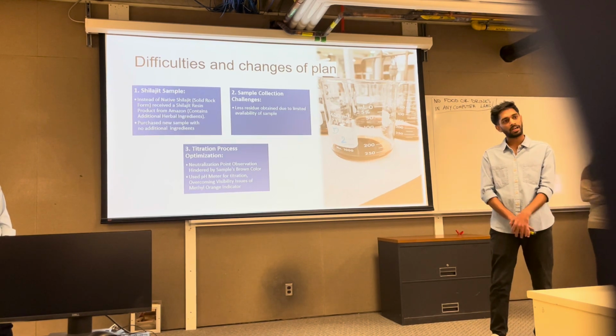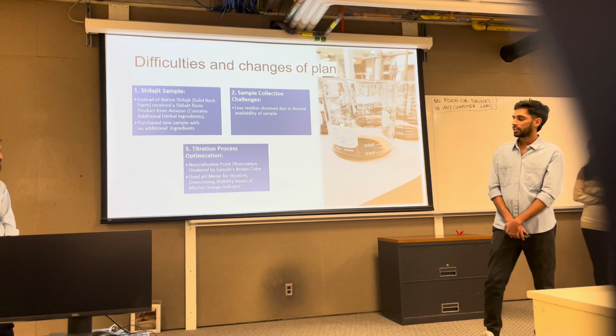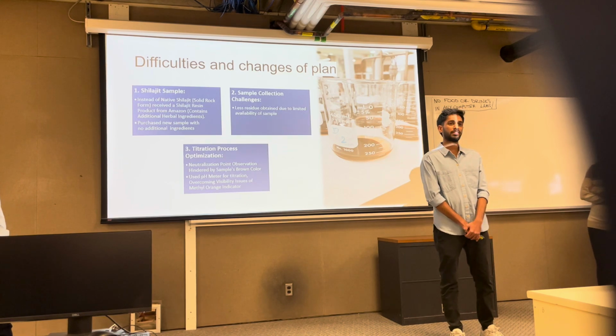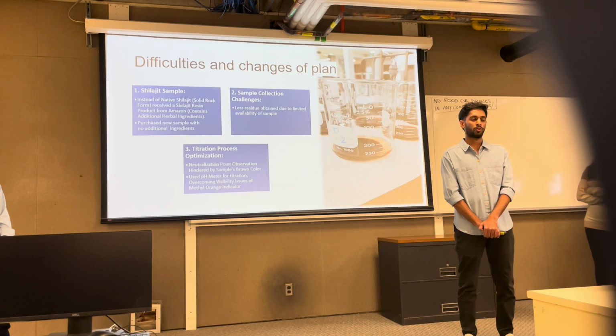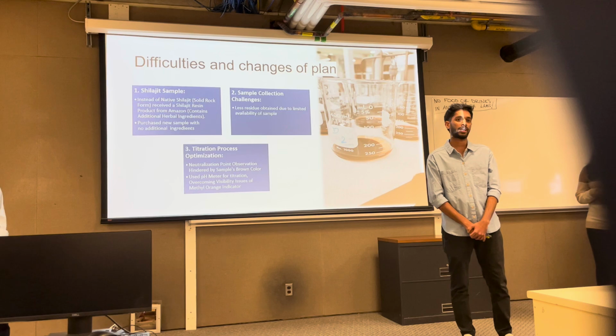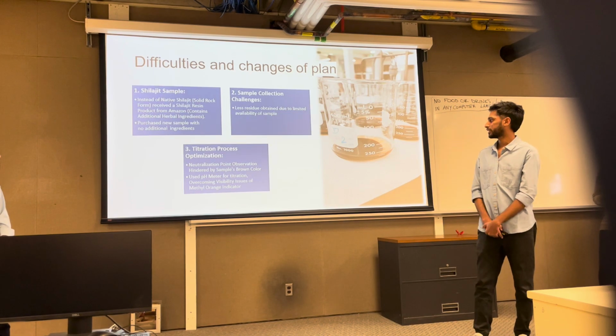So we purchased another sample and we tried the same procedure with it. And the other challenge that we faced is we got only 50 gram of sample. So we did our procedure according to that, and we got our residue in very little quantity.